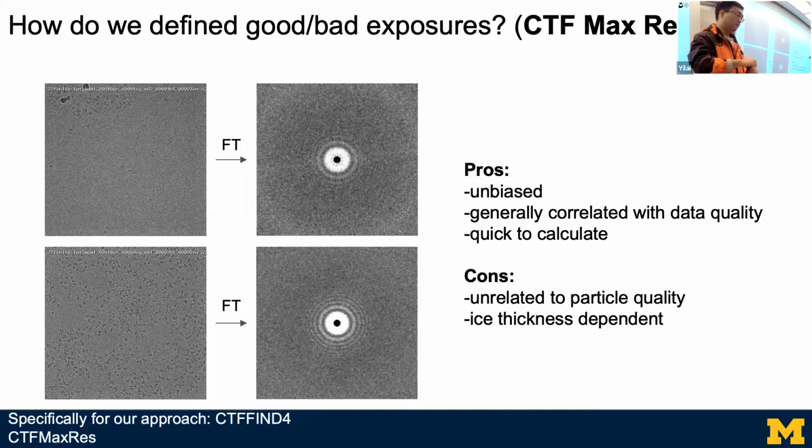The good thing about it is this is an unbiased approach, generally correlated to data quality, and very quick to calculate once you have the micrograph. The bad thing is that it's unrelated to particle quality and is also ice thickness dependent. So if you have, say, a particle with aggregation, in many cases you will get very good CTF resolution, but not a usable micrograph. But we just go with this CTF resolution because we think this is basically the best we can do to evaluate a good micrograph.